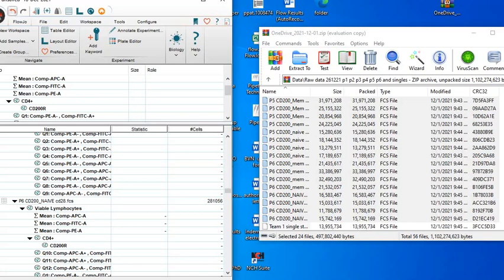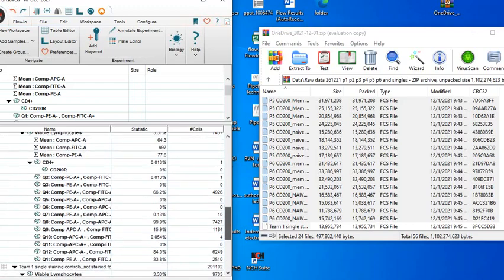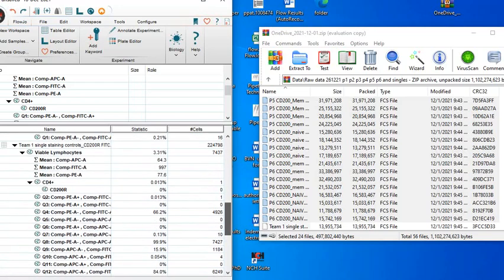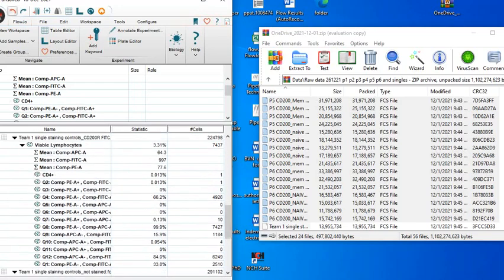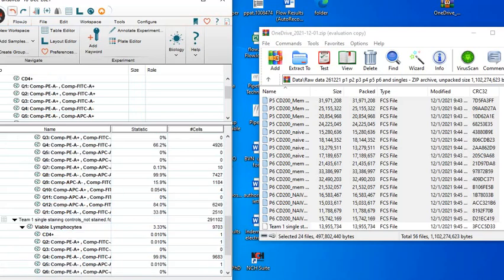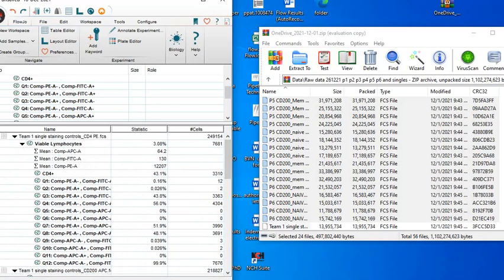We missed something, so we are going to add that now. That's why I said the Flowjo is quite easy to handle. When something is amiss, you can tell quite easily, and what you have to do is you follow up and you update.